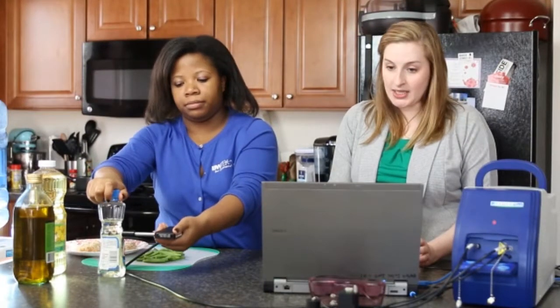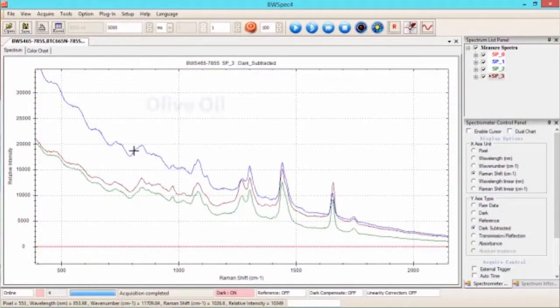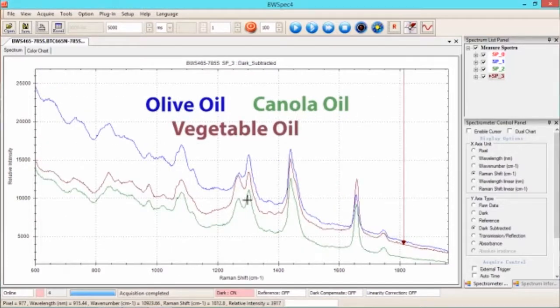As you can see, the three spectra are overlaid here. They're very similar because they're all vegetable oils, but they're a little bit different because each one has a slightly different concentration of the various components. Basically, through this we can tell that the olive oil you bought in the store is what it's supposed to be.